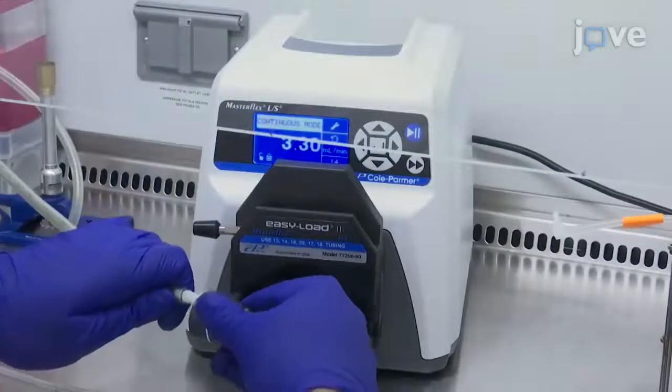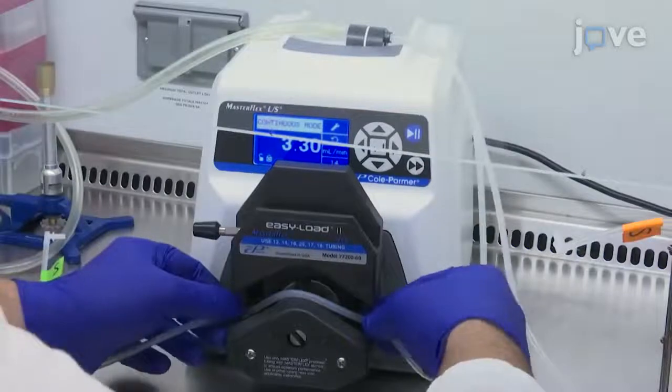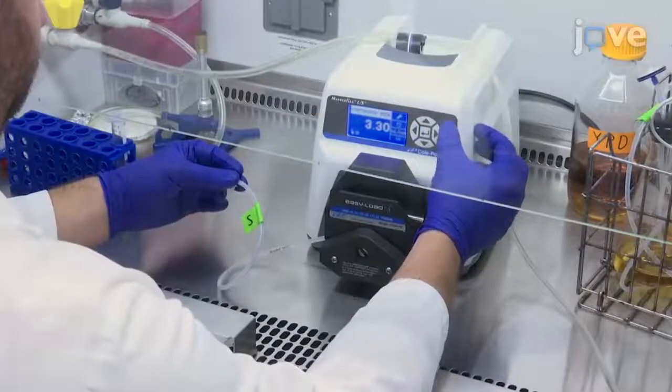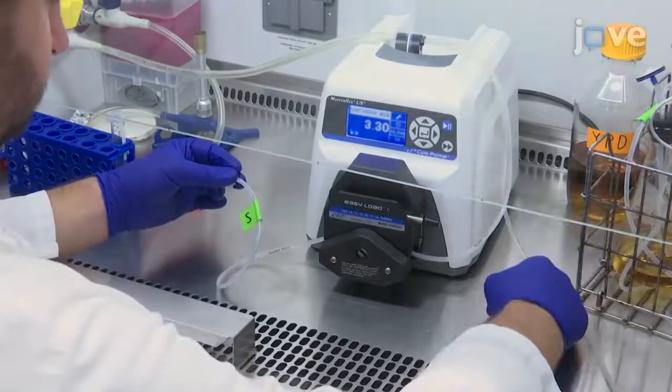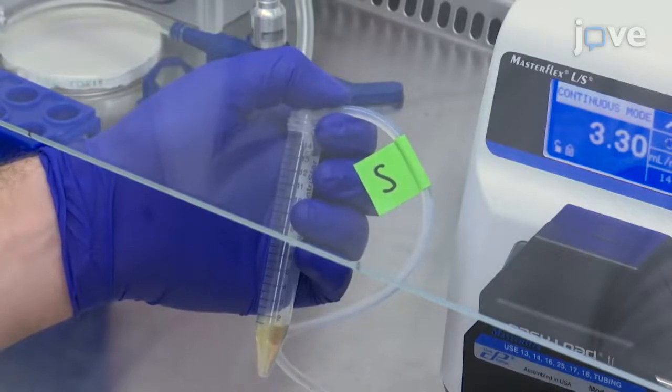Attach the bubble trap to a vacuum and connect the pump to the green side tubing downstream of the bubble trap. Pump the fluid at a flow rate of 3.3 milliliters per minute to completely fill the green side. Then dispense and discard approximately 1 to 2 milliliters of the media, because the first couple of milliliters often contain dead cells or random debris.